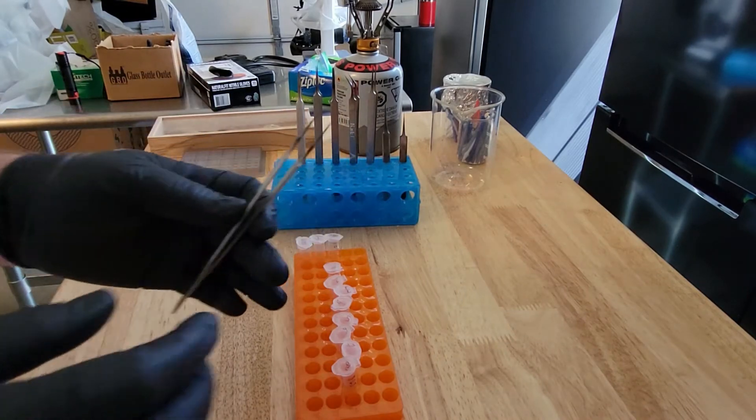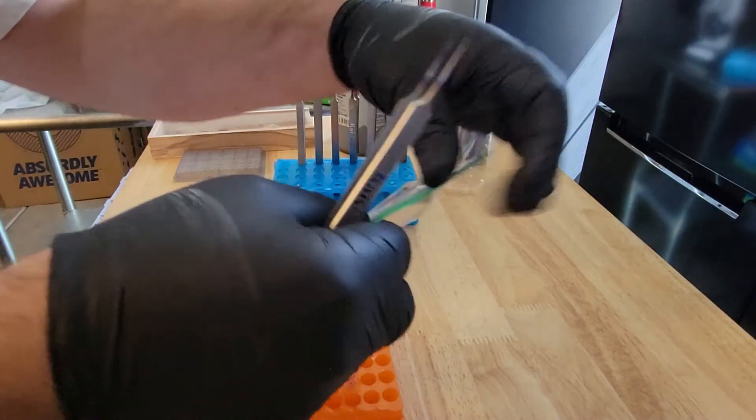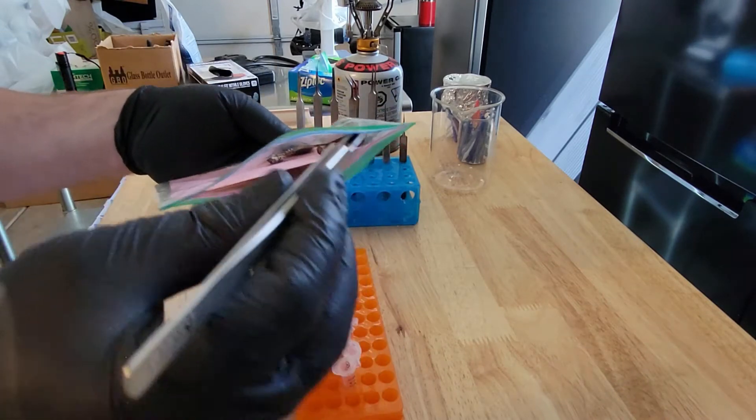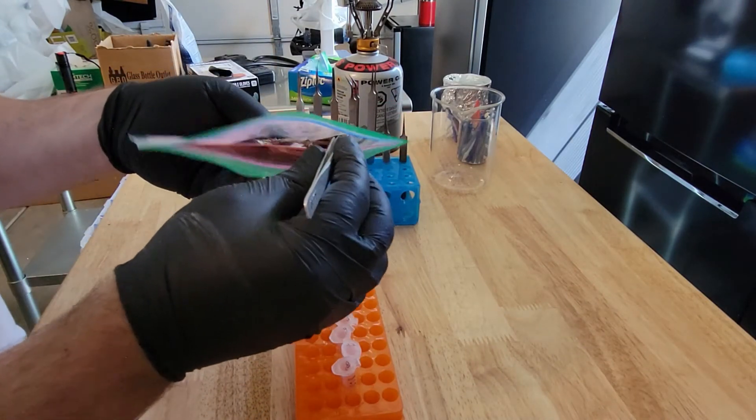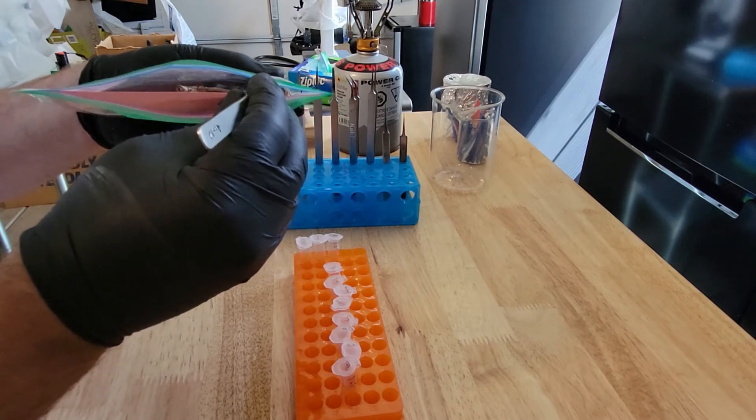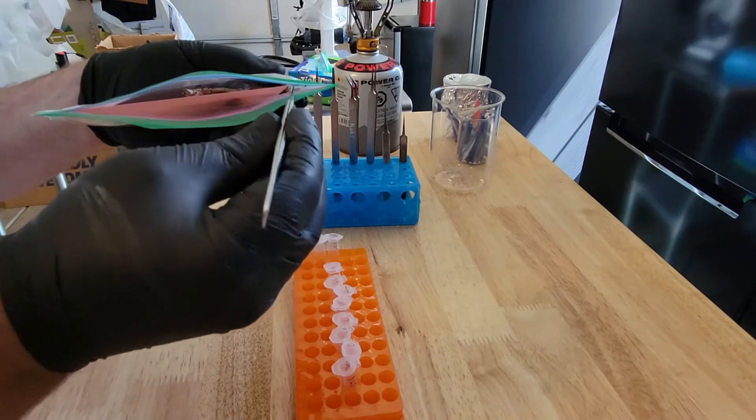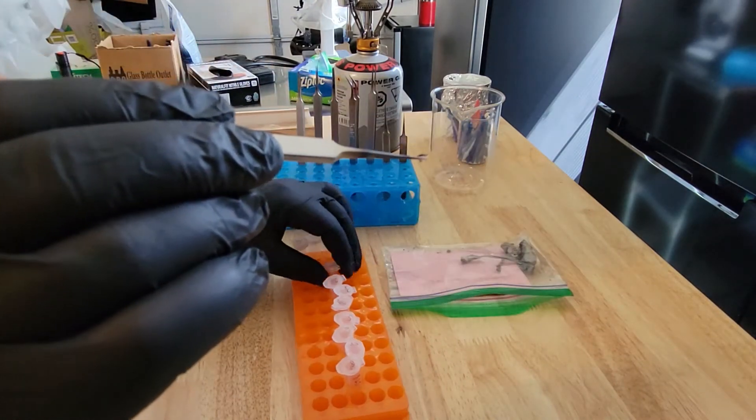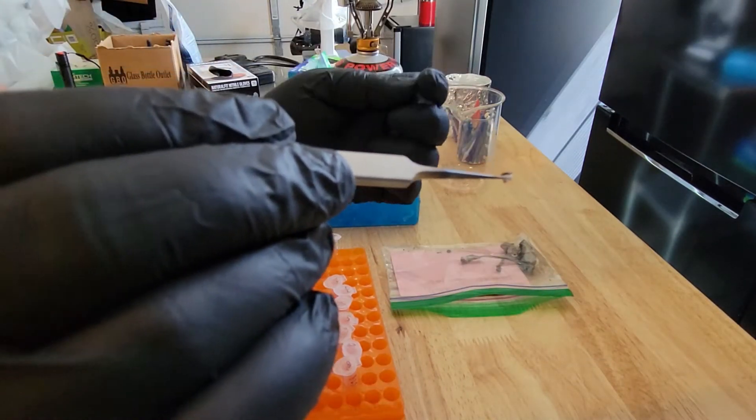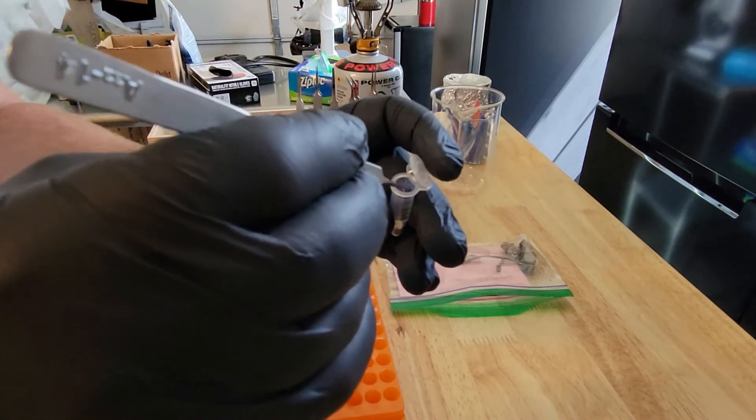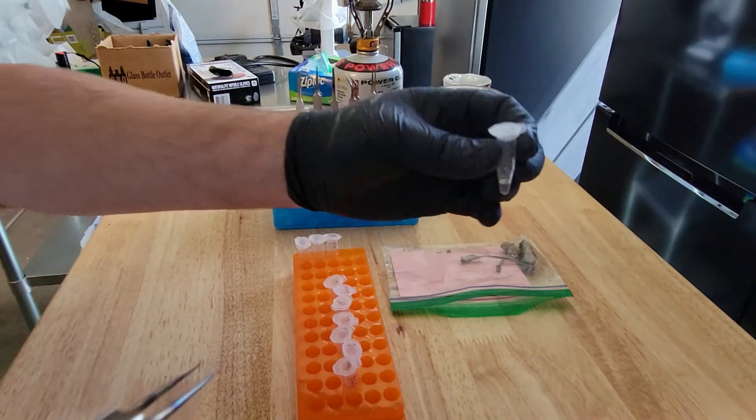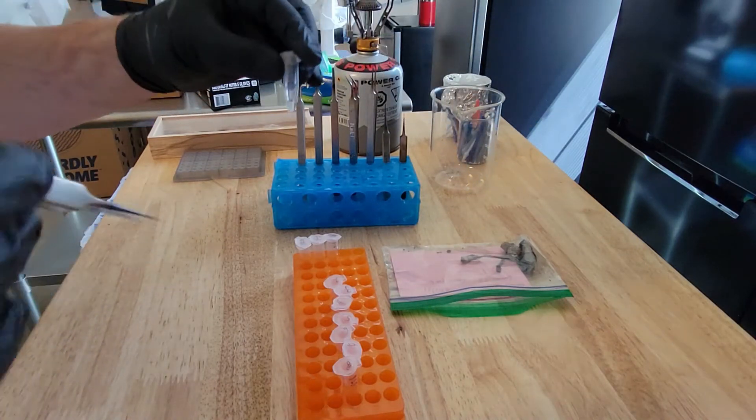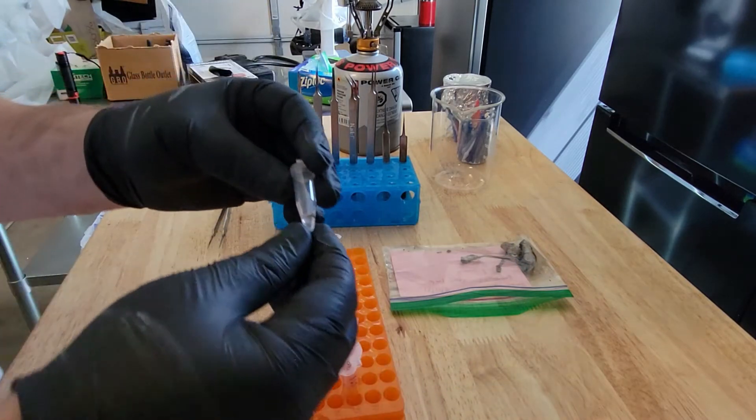Once we've sterilized our tweezers, we're going to take a sample of mushroom. I'm not going to touch the mushroom itself. I'm just going to stick the tweezers into the bag and pull off a very small piece. A very tiny piece of tissue. Even this is more than is necessary. I'm going to place it into the tube. Close it. Now you can see the small piece of mushroom floating in the tube.